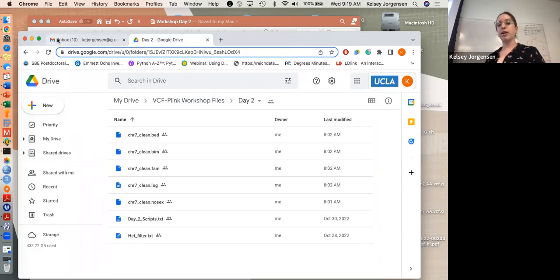Okay, so I'm gonna do some basic background knowledge for what we're gonna do today, and then we'll take a break, and then we'll do hands-on, and then we will enjoy the rest of this rainy day. While I am giving you basic background knowledge, I highly encourage going to the Google Drive if you haven't already and downloading these files. This has the heterozygosity removed and we'll be working with it today. And it's in day 2.